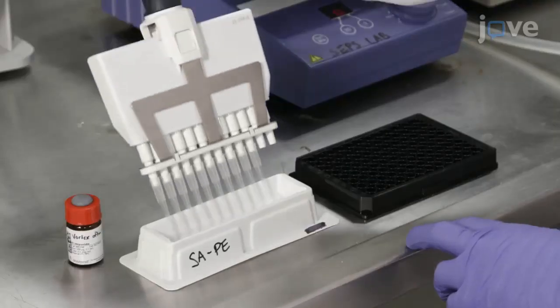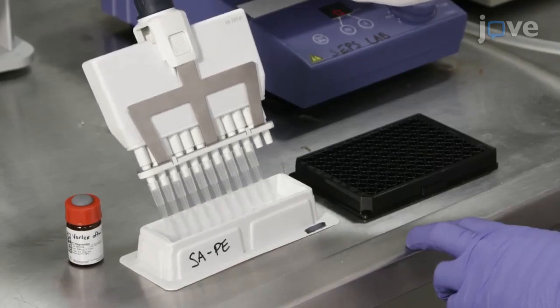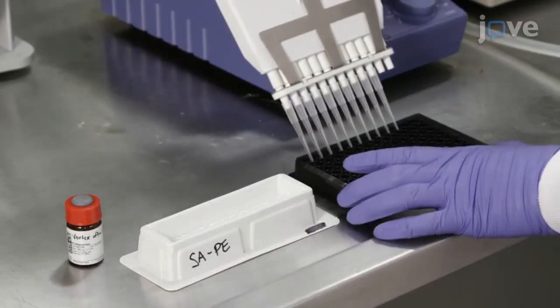The assay is time-consuming to develop, but once a QMI panel is in hand, network-scale data can be collected about signal transduction systems in a relatively simple overnight assay. QMI requires the accurate pipetting of different samples and reagents into 96-well plates. Careful notes should be taken when setting up and running each assay to prevent errors.